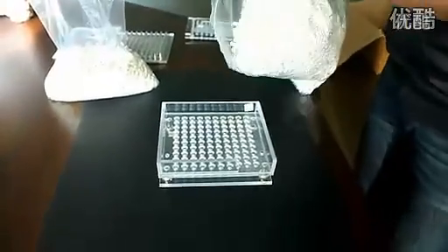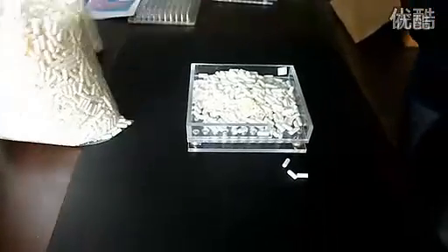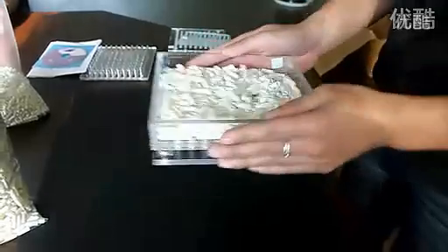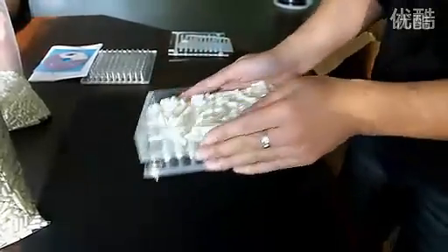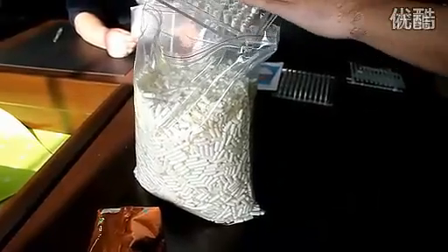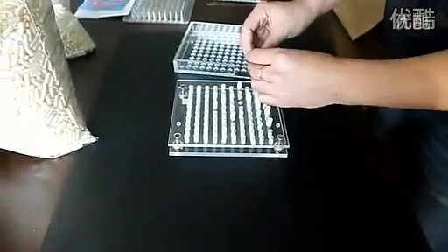Pour bottoms into the encapsulation sheet and shake as before to fill the holes. Pour off the excess bottoms. Remove the filled encapsulation sheet and put it carefully to one side.